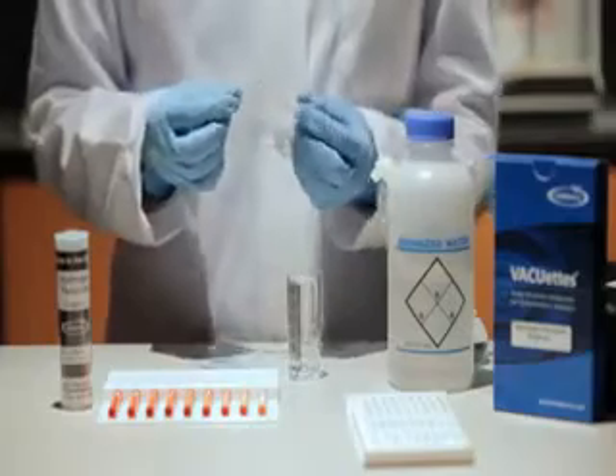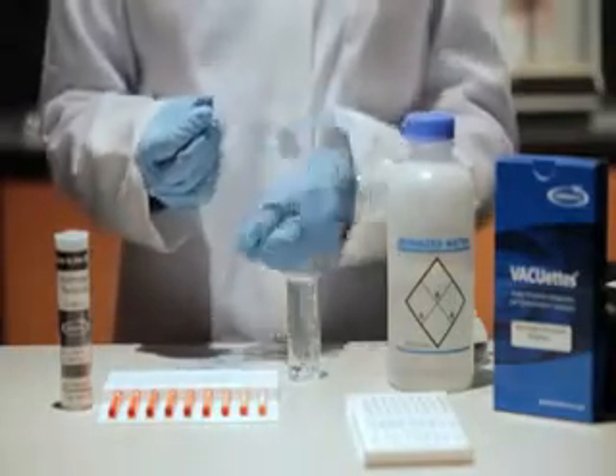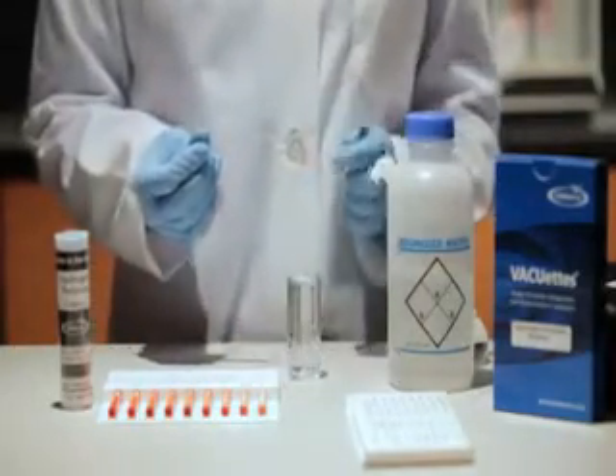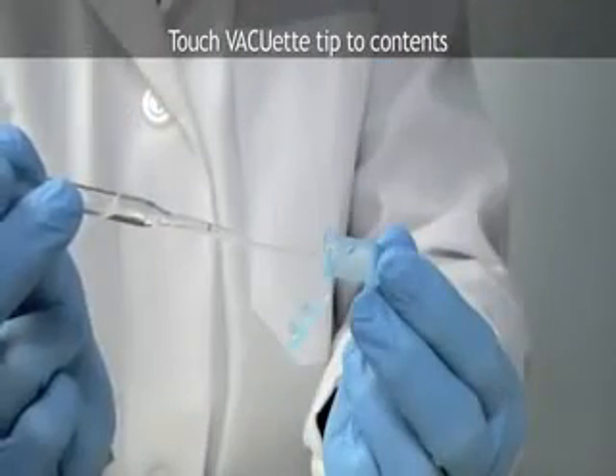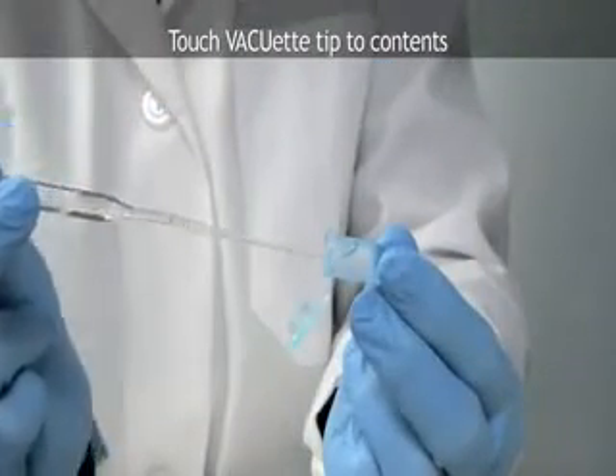Making sure that the VACUETS tip is firmly attached to the ampule tip, hold the ampule in a horizontal position and touch the tip to the contents of the microtest tube. The capillary tip will fill completely with sample.